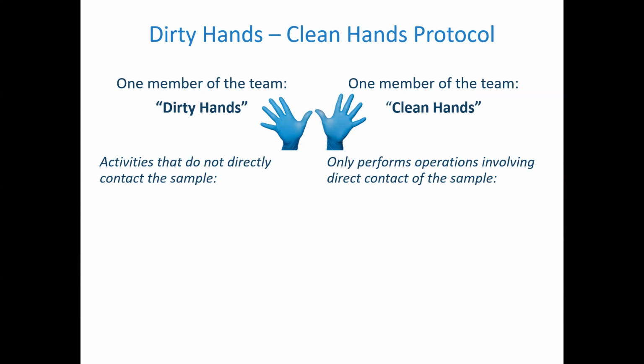And a lot of people blank because they've never heard it before, but it's actually a pretty important protocol. And I have a video I'll show you of some people doing it as well that explains it quite well. But the whole idea is you have two people taking the sample. One person we call dirty hands, who's doing stuff that doesn't touch the sample, and the clean hands person, and that person is touching the sample.